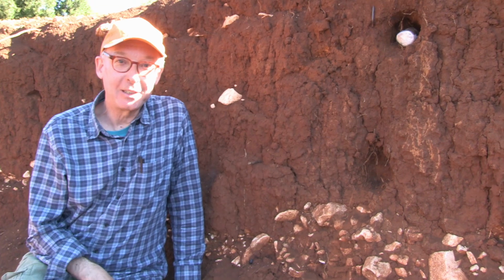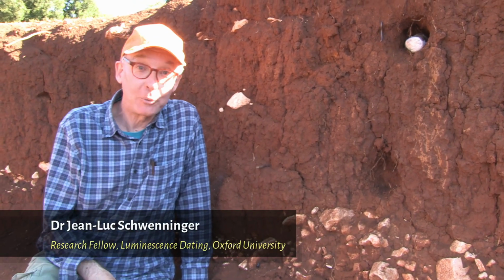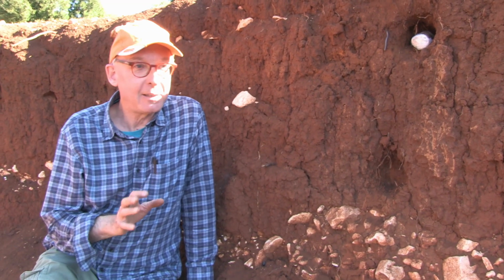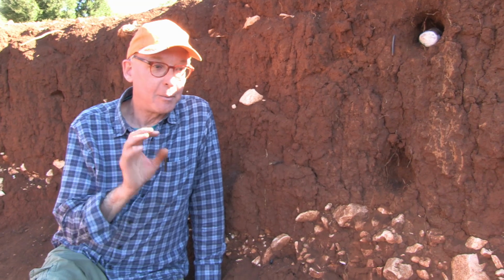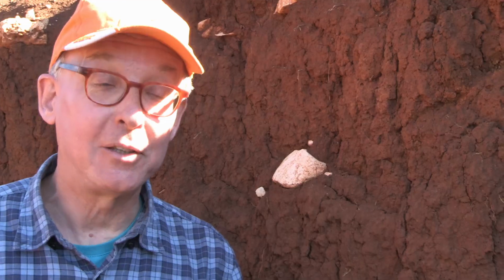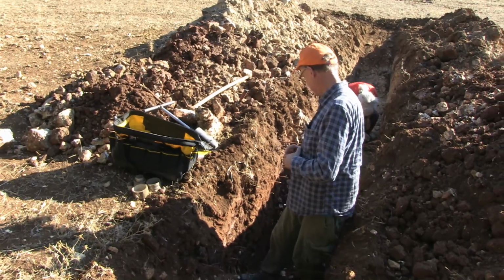The technique which we're using is generally known as OSL dating, and OSL stands for Optically Stimulated Luminescence. What it allows us to do is to date the last time mineral grains within the sediment have been exposed to daylight. We can date young sites, and this is one of the advantages of luminescence dating. We can date things which might only be 10, 20 years old, up to maybe 500,000 years, and we are looking at extending this age range to maybe 1 million.